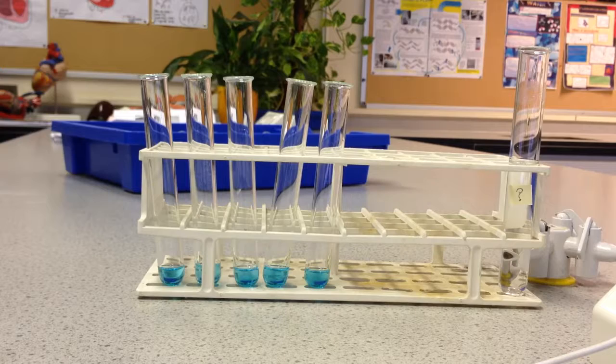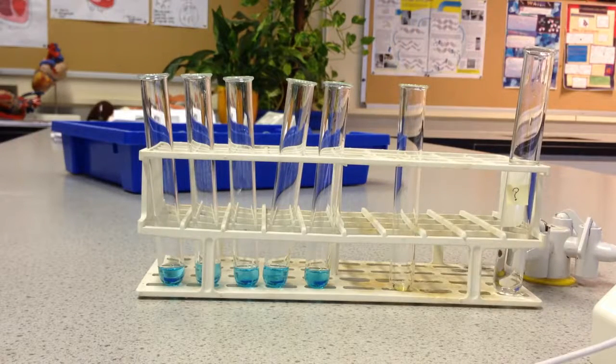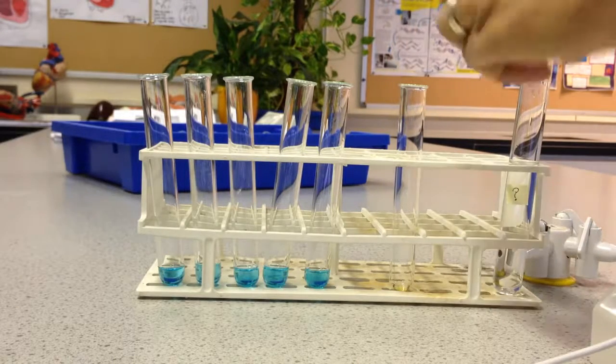Once that's done, we also repeat the test for our unknown solution in the same way.